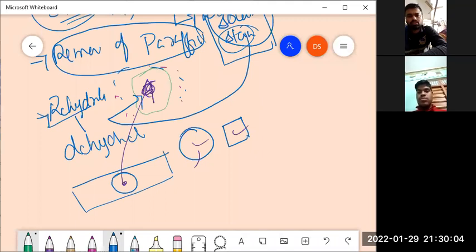Okay. So now your tissue is prepared. You can now put this slide under the microscope and can carry on with your observations. Okay. I will have to describe few stains now. The basic classifications of the stain, and for that I will be taking another class next week, on which some common stains and their chemical affinity would be described and discussed. Okay.